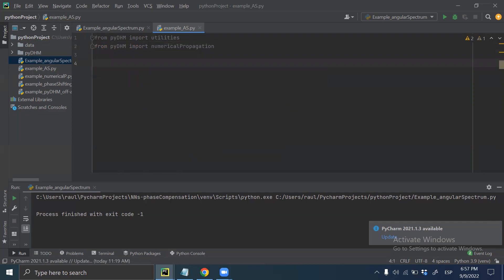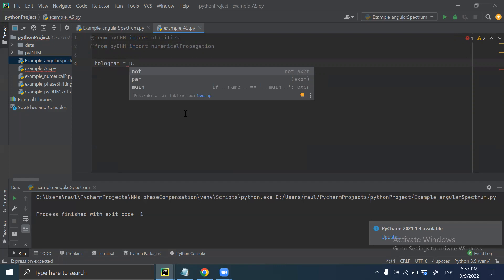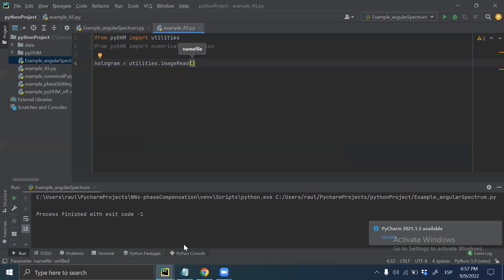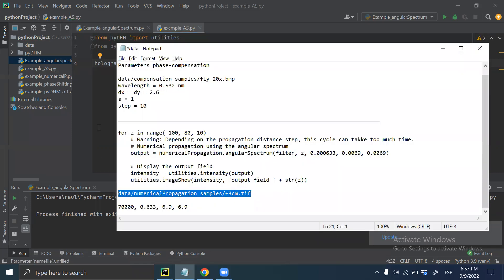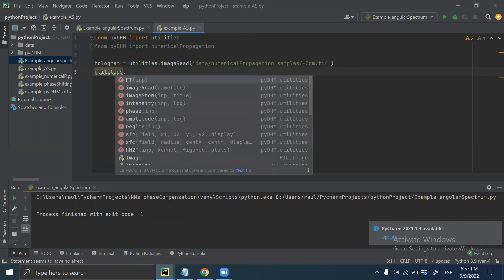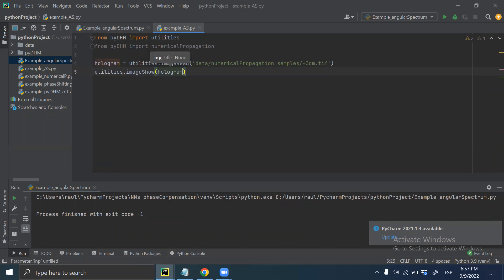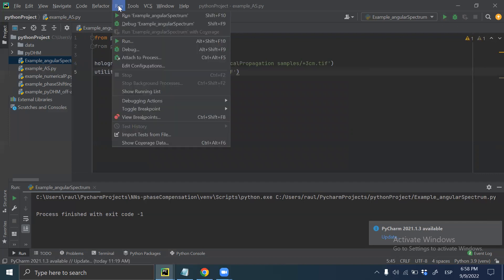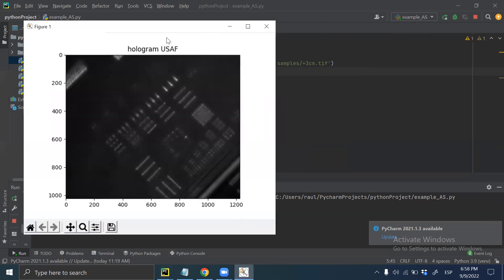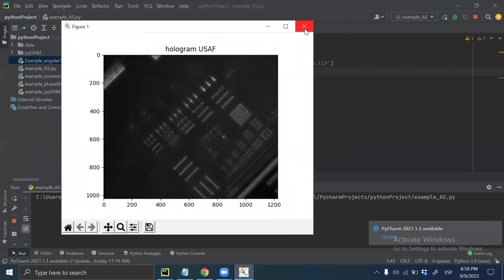The next step is loading the hologram. The hologram is loaded using the utilities image read function and the name of the hologram file. The hologram corresponds to a USAF test target. To display it, we call utilities image show and pass the hologram along with a title, for instance 'hologram'. This is the hologram that I want to reconstruct using the angular spectrum approach.